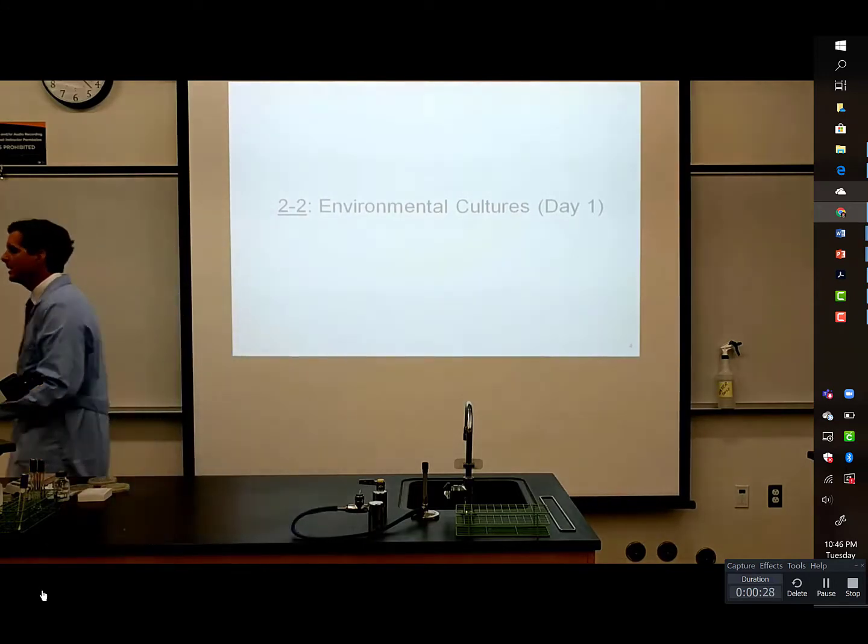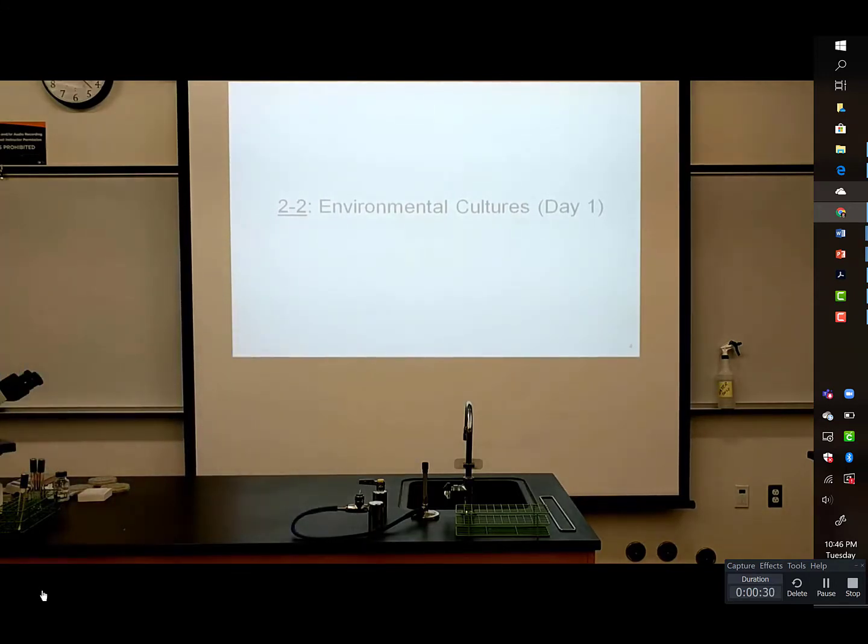So let's take a look at this word culture. Culture is a term that medical doctors will use, like to culture, say, a patient sample, but what are they culturing? Or in lab here, what are we culturing when we culture a sample?